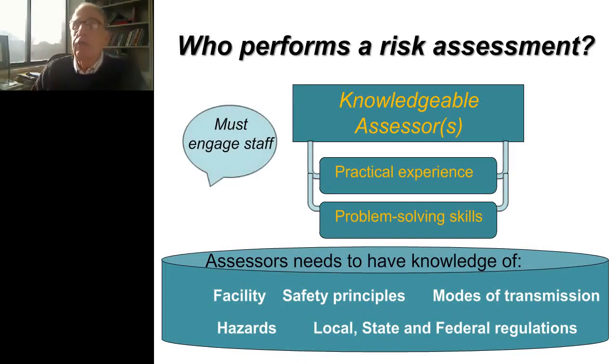Your next question is, who's going to perform this risk assessment? Well, any number of people could be doing this, but you want it to be somebody who's knowledgeable, has had practical experience, and has good problem-solving skills. It can be a team approach, and possibly a team approach is the best, because you have members of staff, maybe you have a biosafety officer or an experienced individual who's responsible for biosafety, and they get together and go through the process of doing the risk assessment.